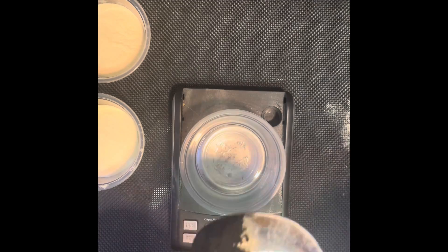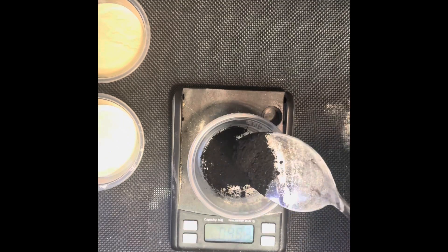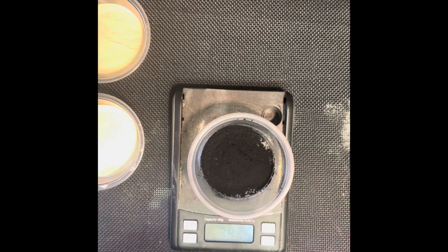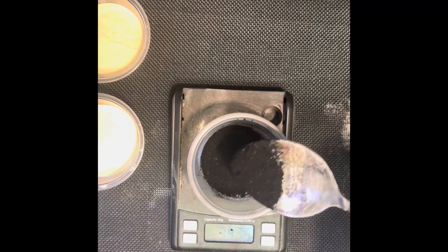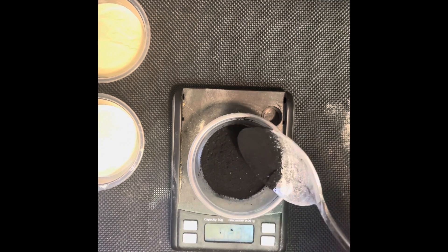For this step, this is optional, but I'm making black agar. It can support growth and you can see the bacteria or mycelium very well. So measure out 5 grams of activated charcoal.